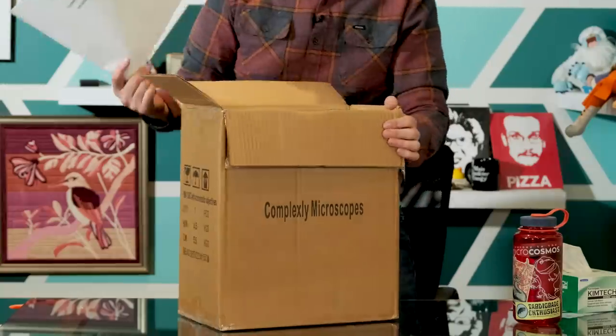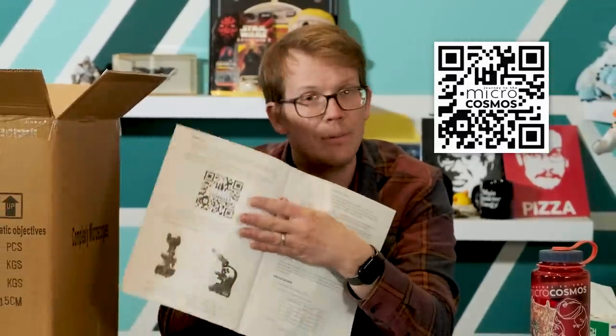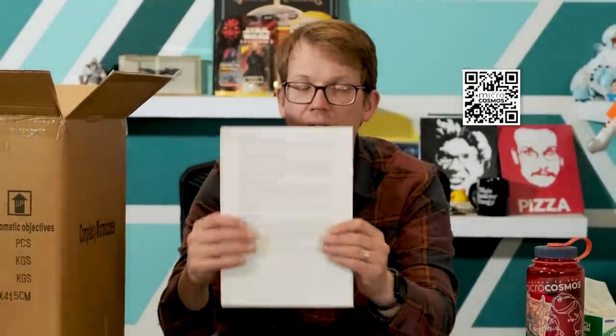The first thing you will find when you open it up is the manual. We built this manual from scratch so you would understand all the different parts of your microscope, how to use it, doing your first samples, getting ready. There's also a QR code that links to a bunch of video tutorials, and this is also available as a PDF — all updated versions will be at microcosmos.store.